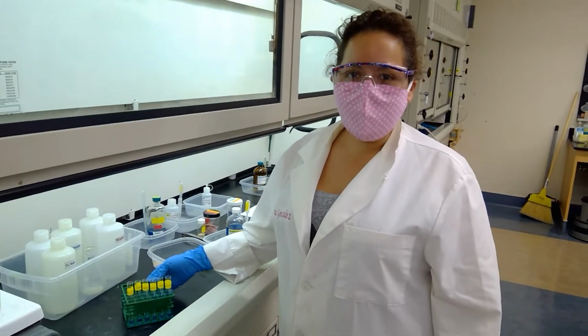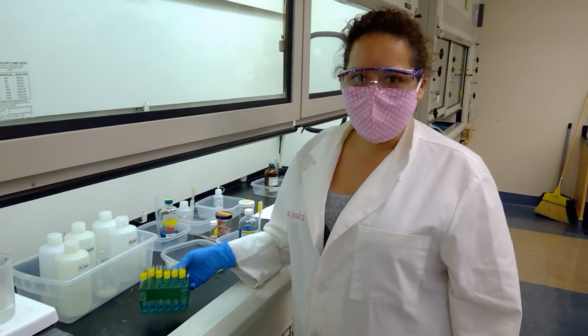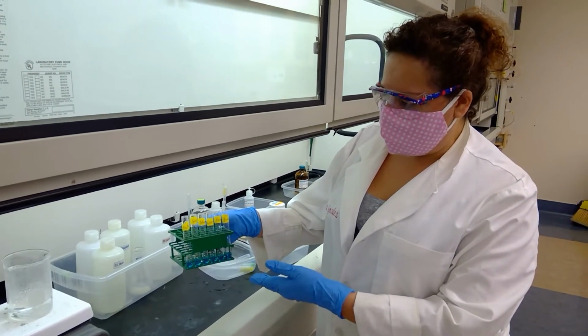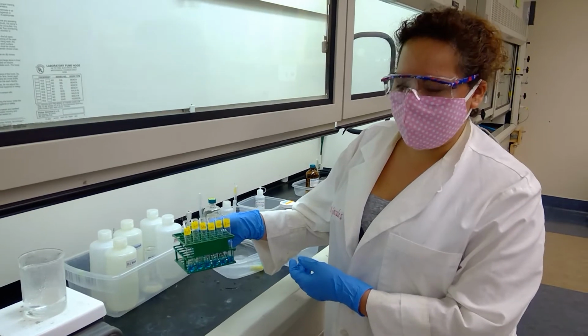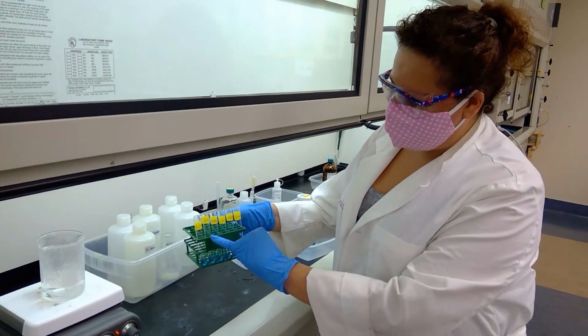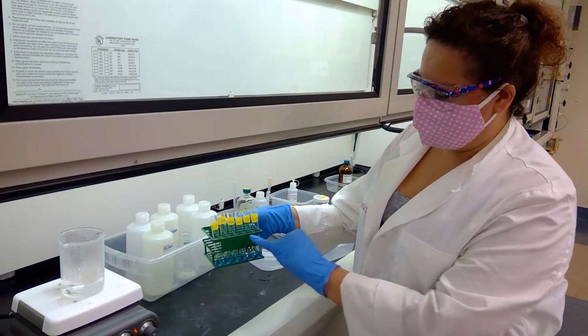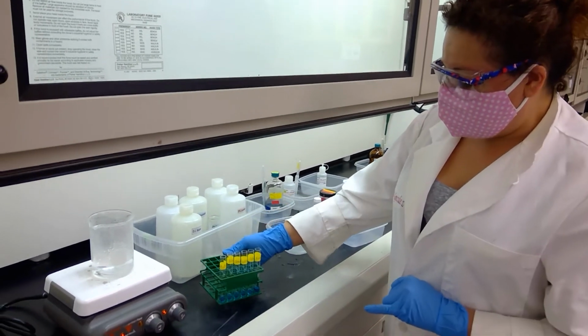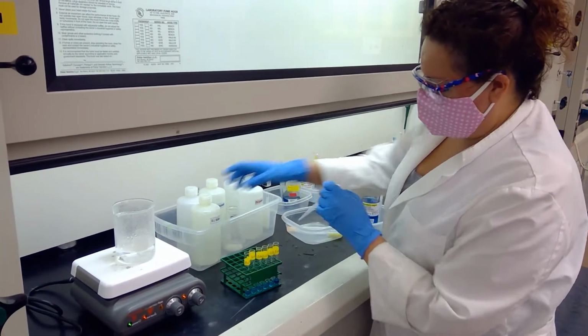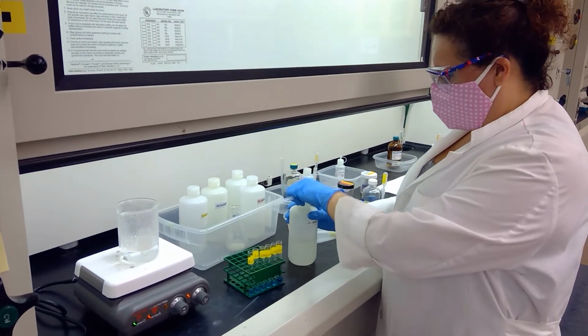All right, students, hi. We're here at the carbohydrates test for our different sugars, and I have here 6 test tubes set up with 1 milliliter of our Benedict's reagent. So we're going to be testing water as our blank. We'll be testing sucrose, starch, lactose, glucose, and fructose. So I'm going to add 5 drops of sample to each test tube here, and then we're going to get these into a boiling water bath.